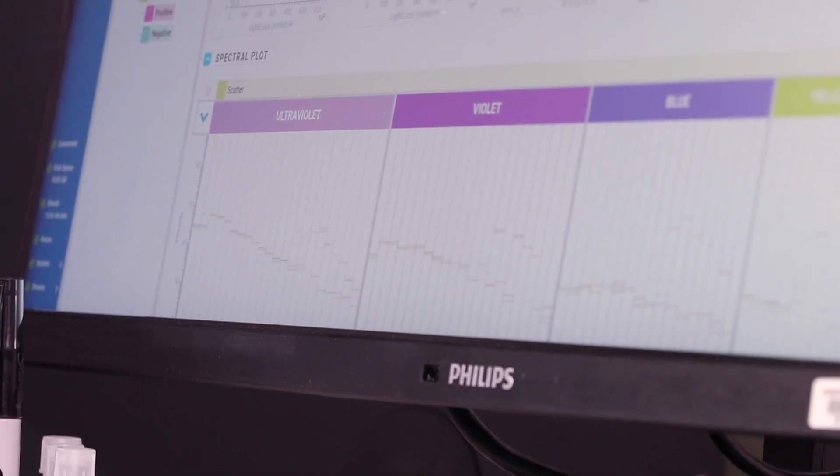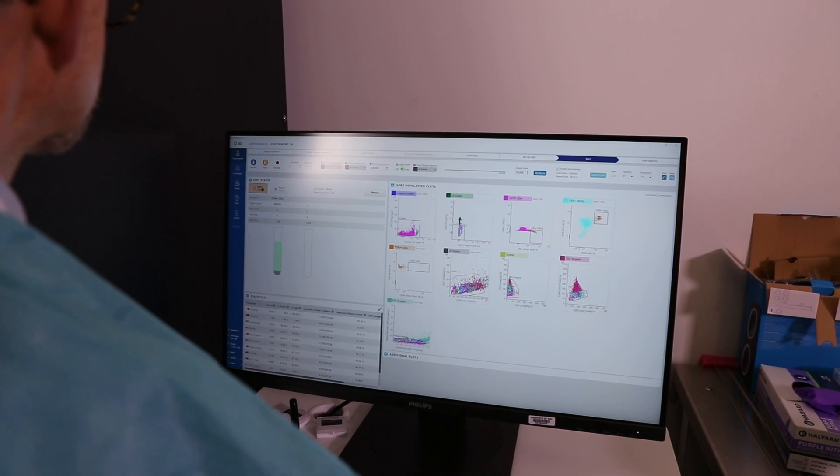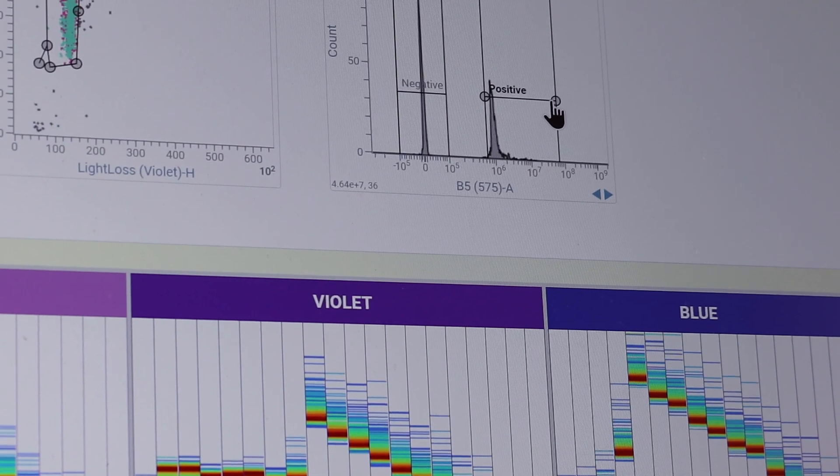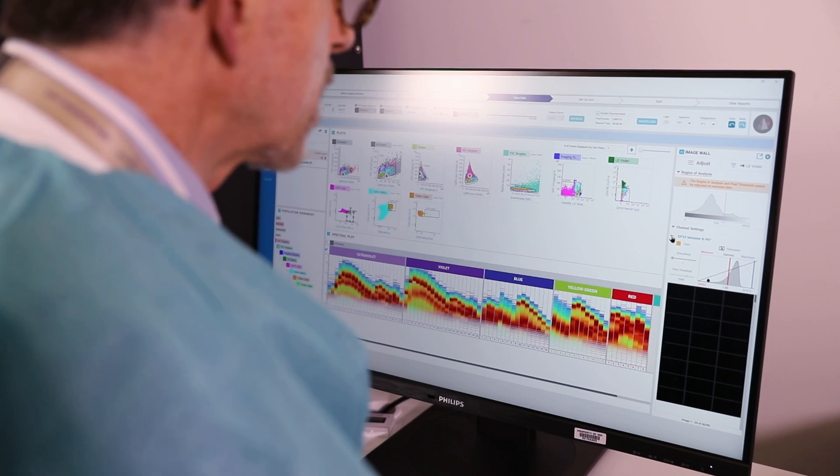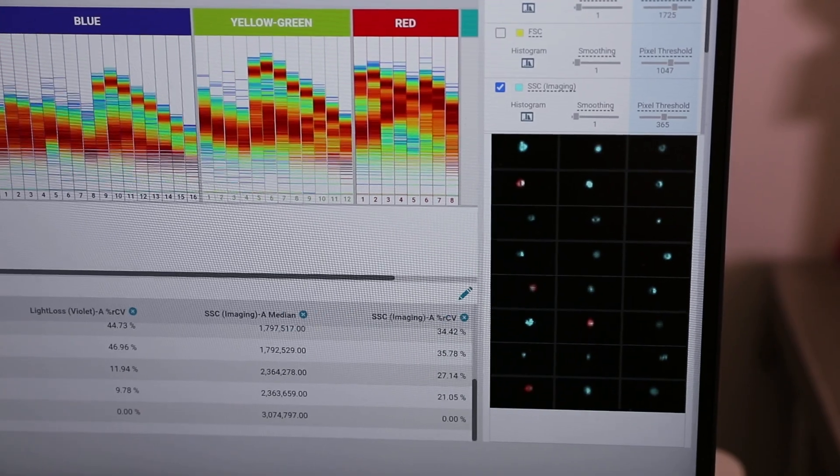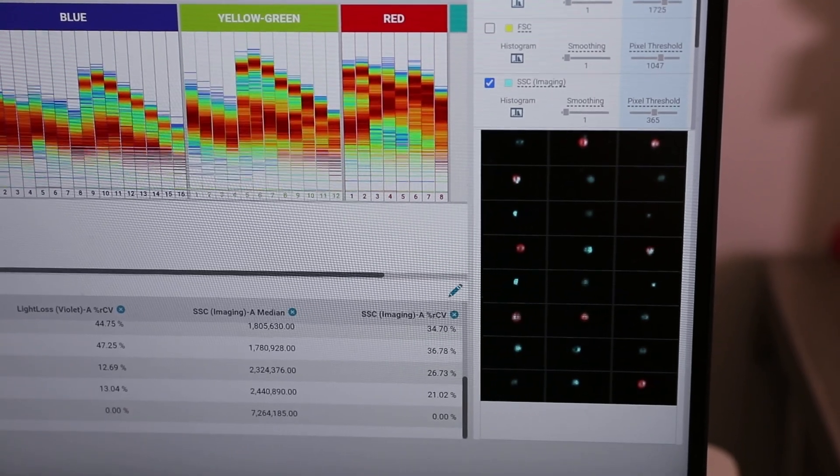Normally we look at just the light signals that come off the cells. So as the cells are interrogated by lasers, we look at physical characteristics. We can actually see what that cell is and look at the physical characteristics of the cell.